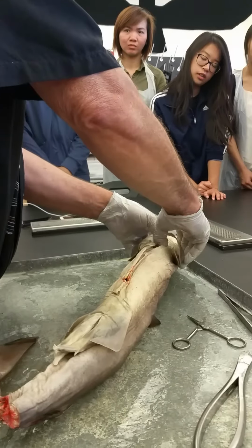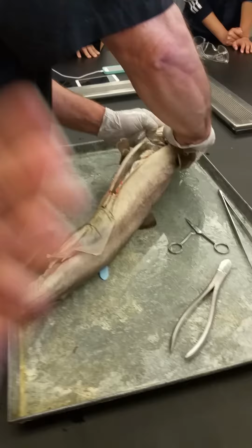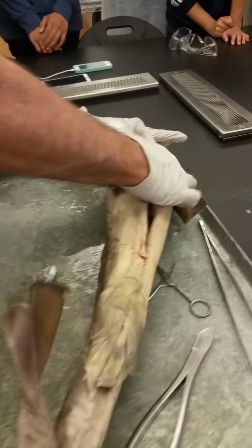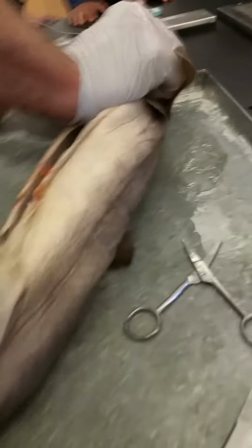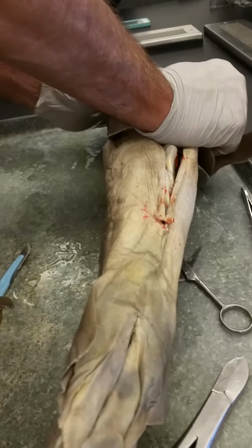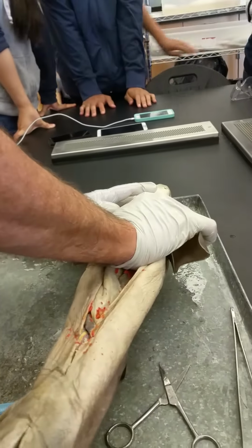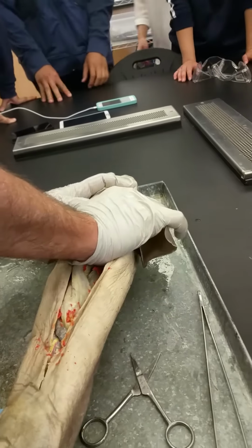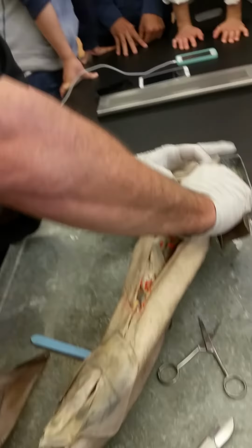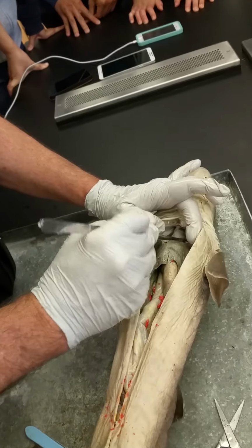Remember, we have a single circuit circulatory system, so blood flows from the heart to the gills, so put your heart there next to your gills. So here's the heart, right between the gills. It's a conical structure, typical of what we'd expect to see in a heart. Where's the heart again? It's right here.